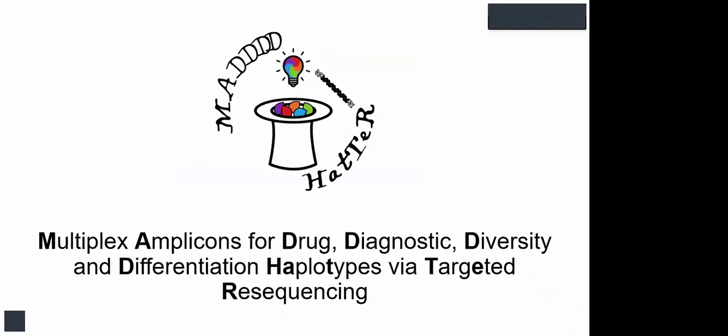So the tool of interest we are going to focus on today is called MadHatter. I know it might have quite a funny-sounding name, but it's a short form for multiplex amplicons for drug diagnostic diversity differentiation haplotypes via targeted resequencing.